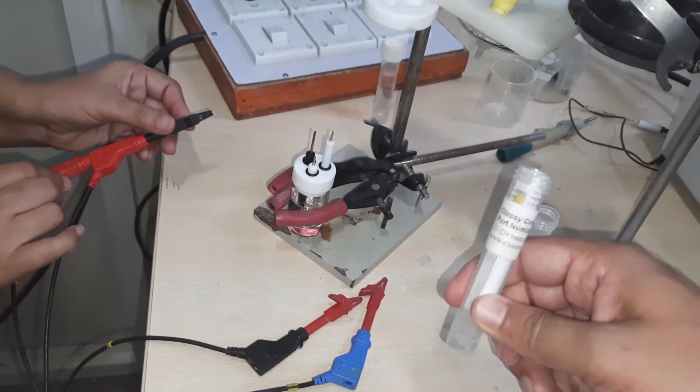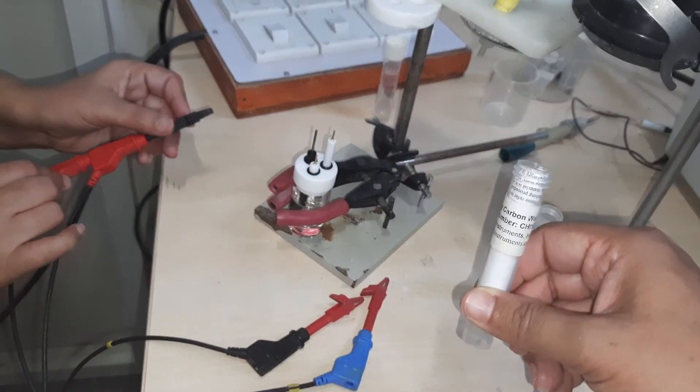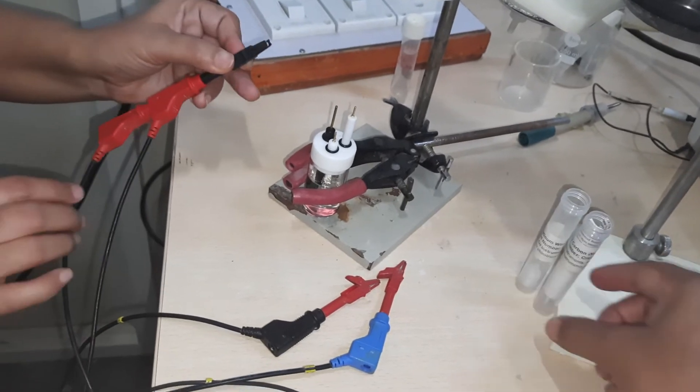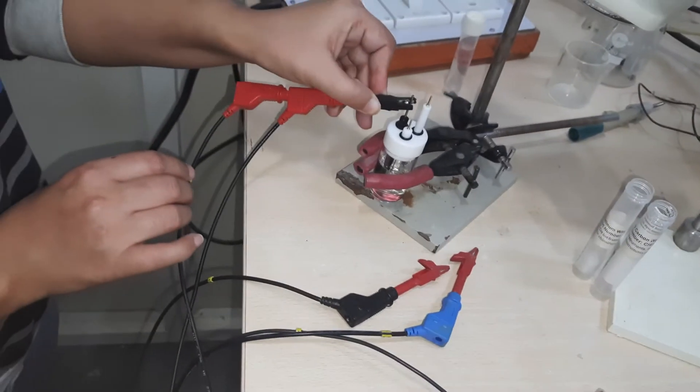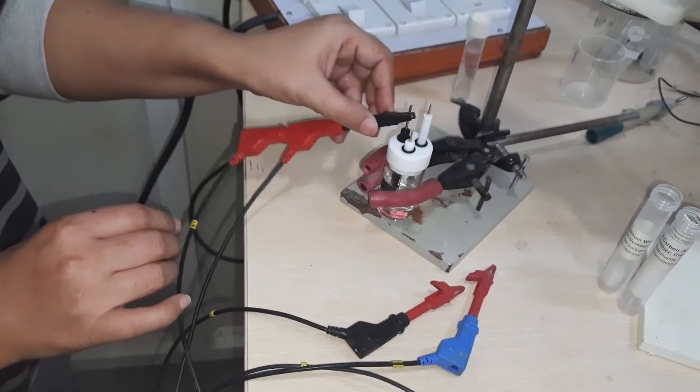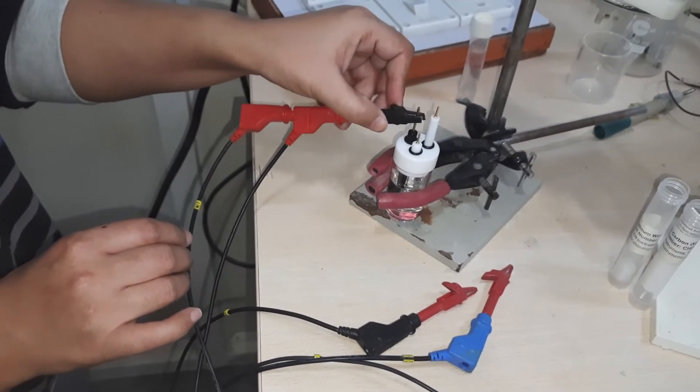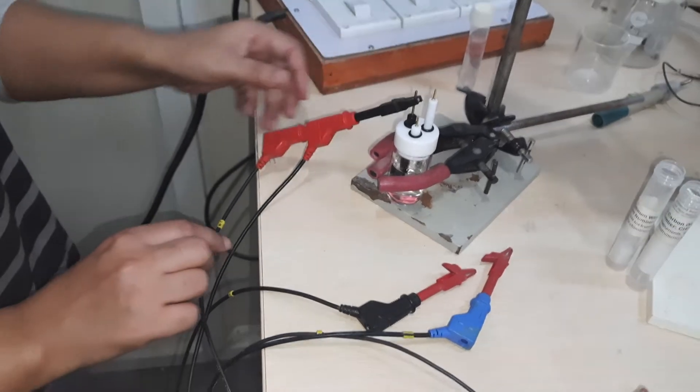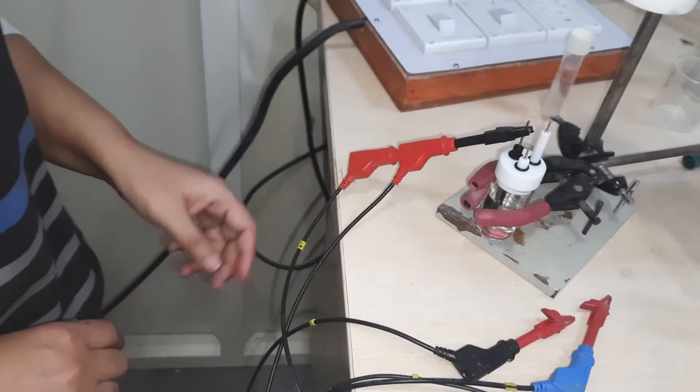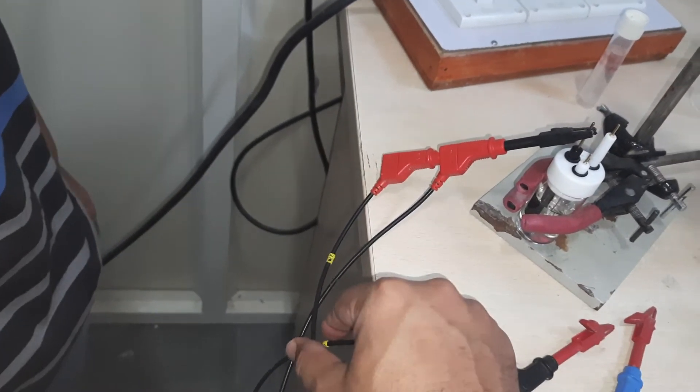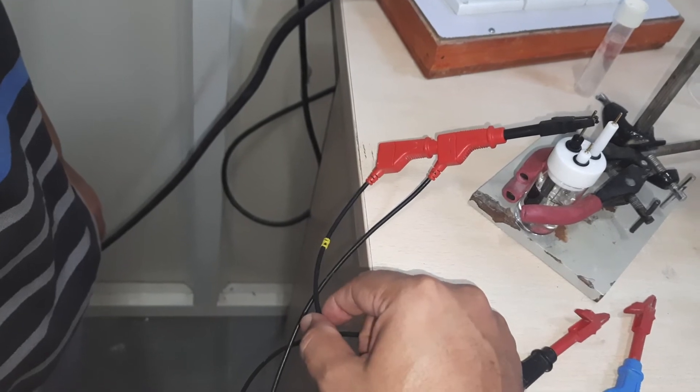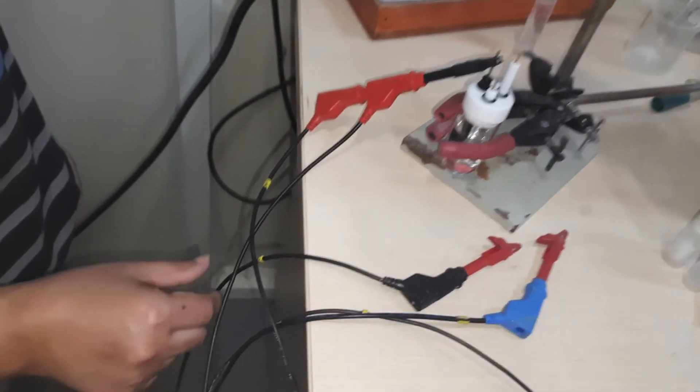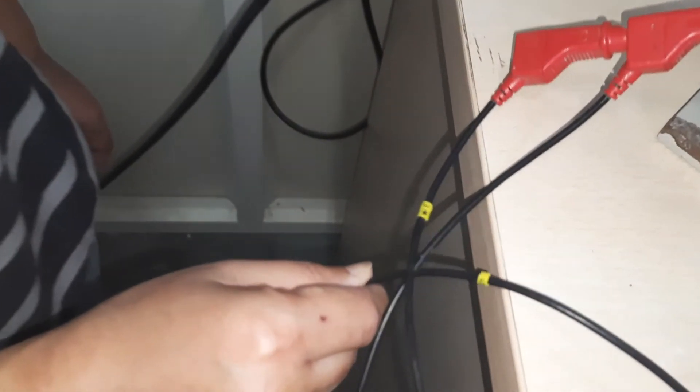Now you can connect. There is a color code generally. You can see over here this is written - WE is written over there, so this is the working electrode.